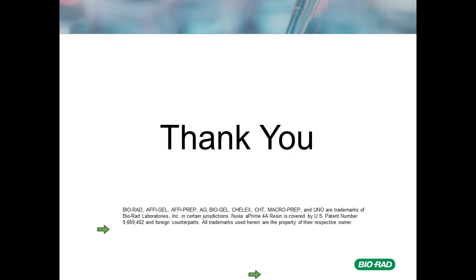What are some of the differences and advantages of using chromatographic methods such as hydroxyapatite versus the traditional methods like size exclusion chromatography? There are a number of traditional methods, but the two most widely used in some of the initial vaccine development programs that I've seen are ultracentrifugation and SEC. The problem with both is they're not easily scalable, with apologies to Westphalia and other ultracentrifuge manufacturers. Ultracentrifuges are expensive, big, take a lot of capital, and can be fairly maintenance intensive, and they don't necessarily scale easily to the very, very large scales required today or perhaps in the future.